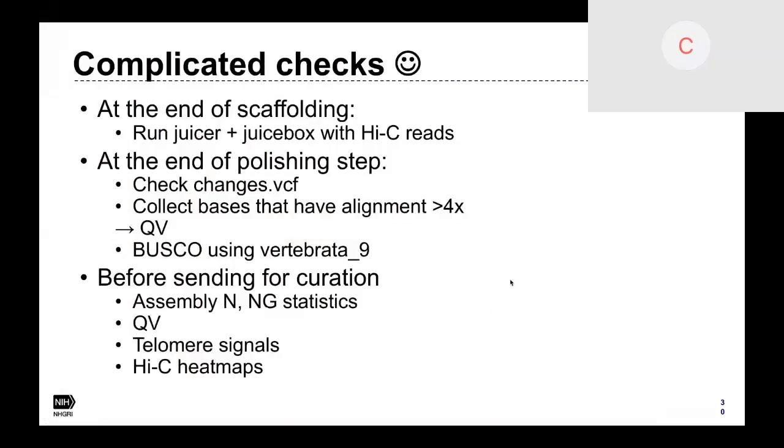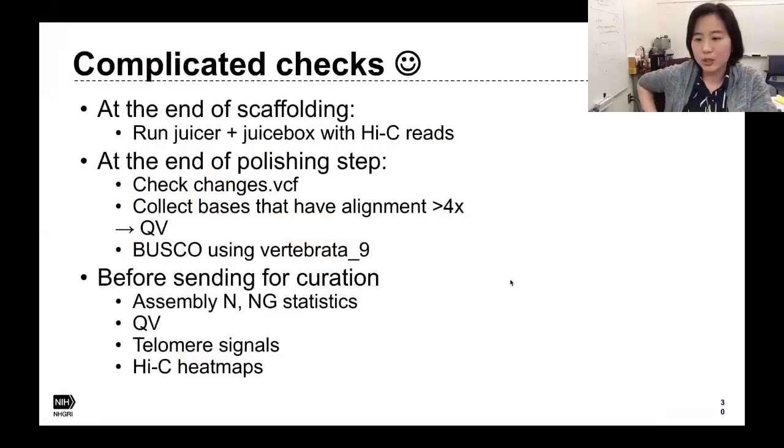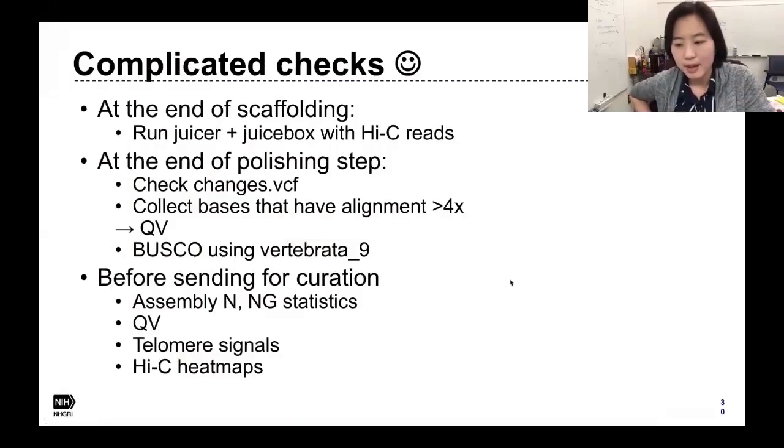In general, the structural errors are not really affecting the polishing step. What Kirsten is going to do is break those points, find the breakpoints. If it's an inversion type error, invert the sequence and place it back. The polishing steps wouldn't necessarily help that much at that point because the breakpoints are going to be ambiguous anyway.